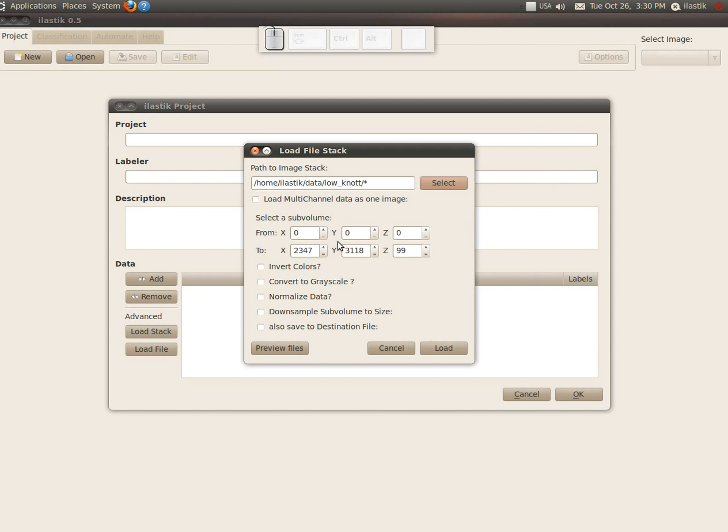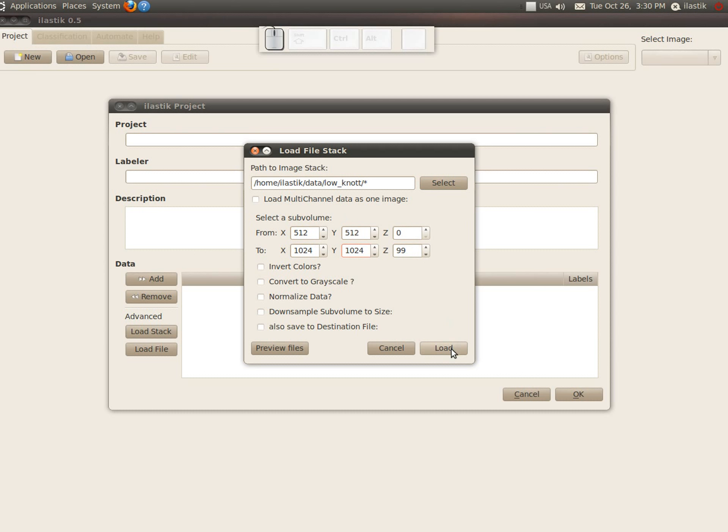Let's not take the whole thing, but just select a smaller subvolume, which you can do with these controls over here. And let's just see what happens if we don't specify any other option.